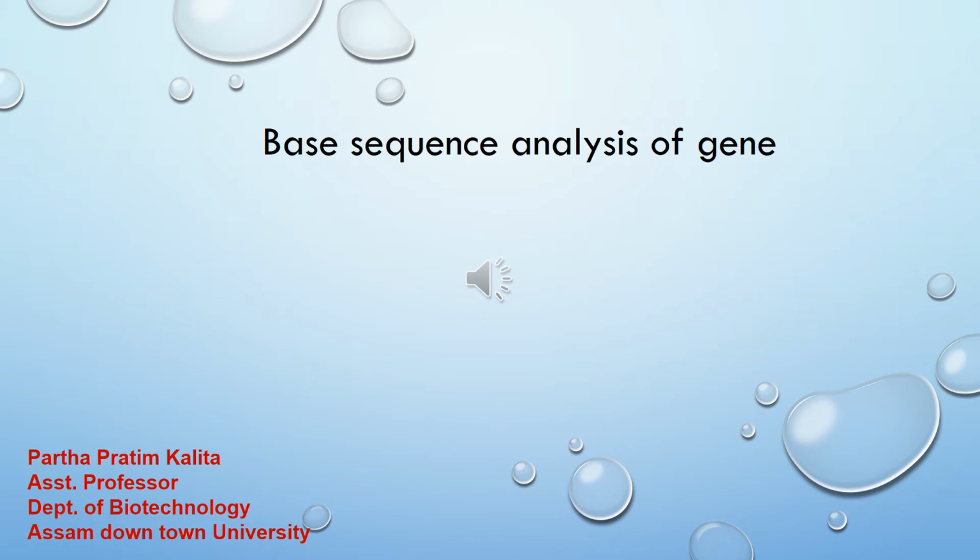Hello students, in this practical video we will learn how to retrieve nucleotide sequence from NCBI. As people know, nucleotides are the biopolymers or large biomolecules essential to all known forms of life. The term nucleic acid is the overall name for DNA and RNA. So when we talk about nucleic acid, it may be DNA or it is RNA.